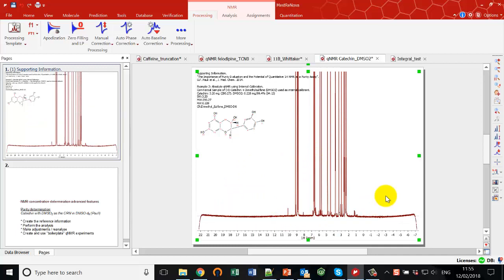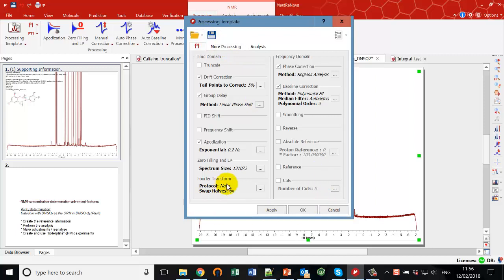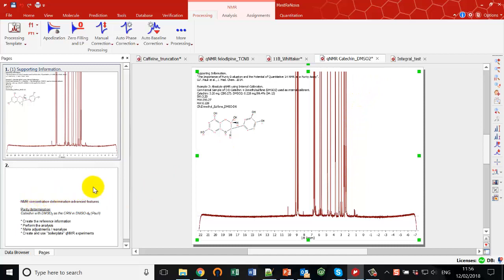So my spectrum is all processed — I've done zero filling, apodization, automatic phasing, and baseline correction. Just to remind you that you have a processing template and all those numbers are collected as you apply them. If you apply the same processing every time, I suggest saving this template so that with a simple re-application you can do all of that processing in one go — that's really handy and will save you a lot of time.